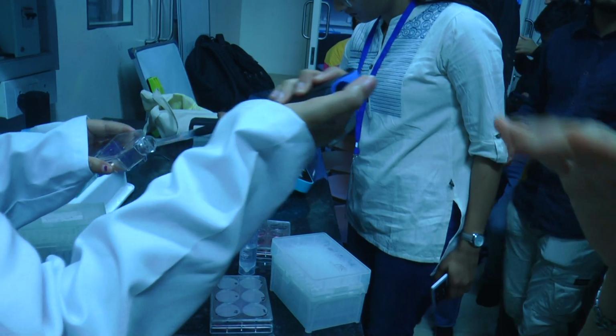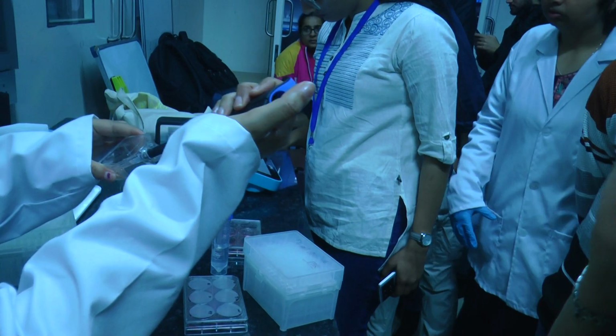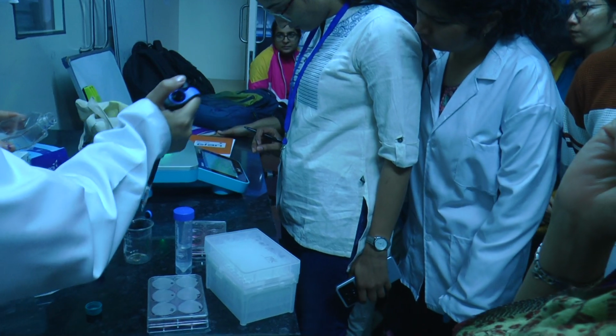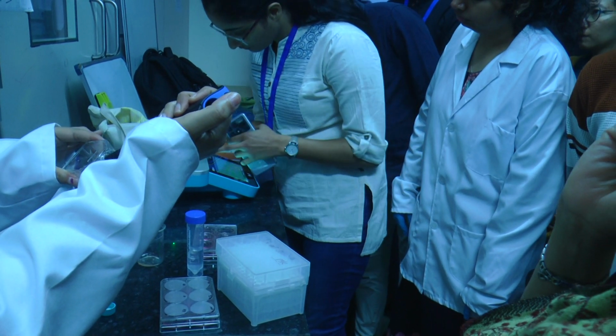So you're just cleaning the pipette, is it? Yeah, I'm just cleaning. What is that? This is the culture media in which we grow the cells, which had FBS and all those things. So first we need to remove it.